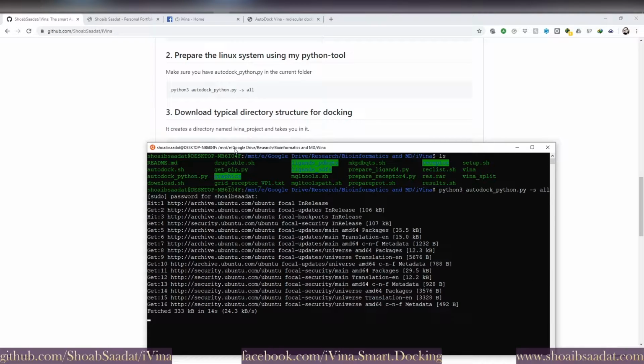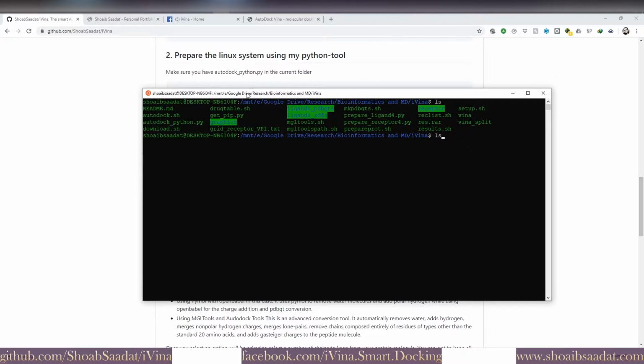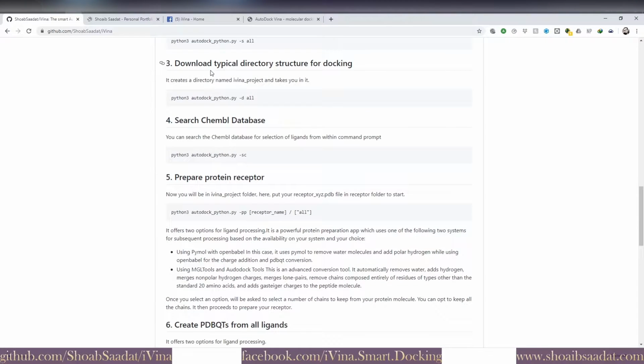Alright, so it's going to do all of that. I'm going to pause for a second and I'll be back. So the basic setup has been done.